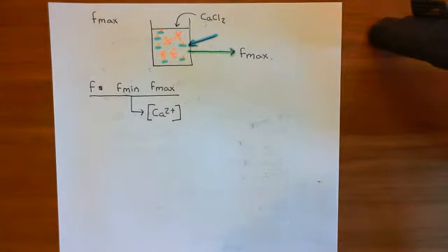You then add some BAPTA, which is a calcium chelator, which will basically nick all of the calcium and bind the calcium to itself, so that there is no calcium left over in the solution, and therefore no calcium to bind to the Fluo-4 molecules. So now all of the Fluo-4 molecules are by themselves in that solution.